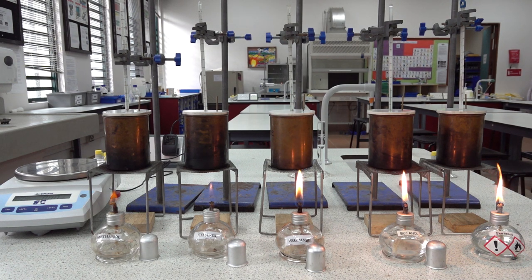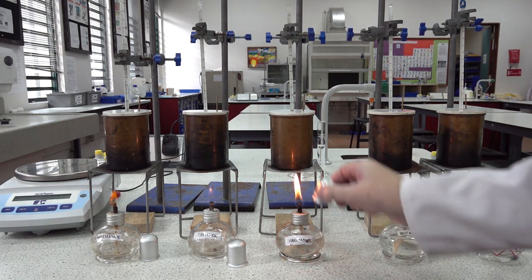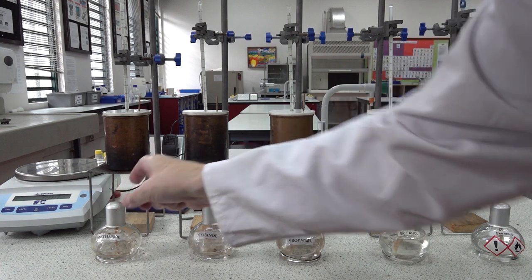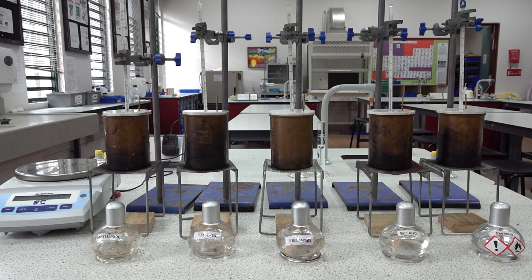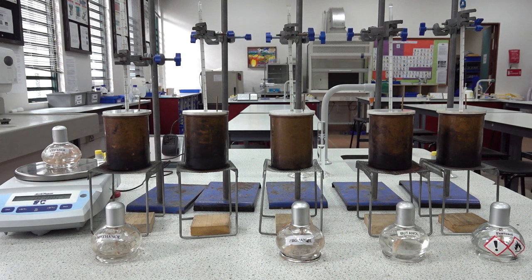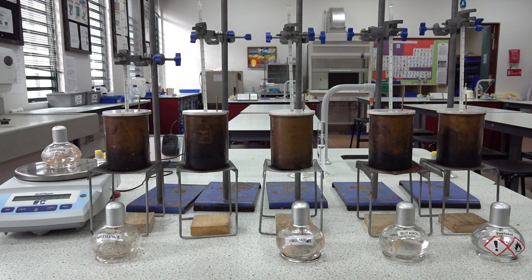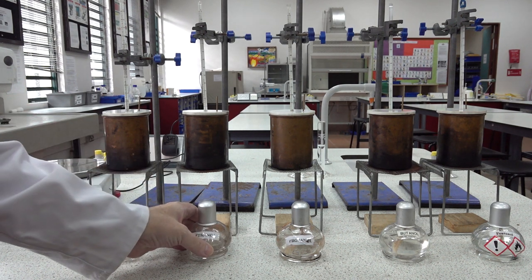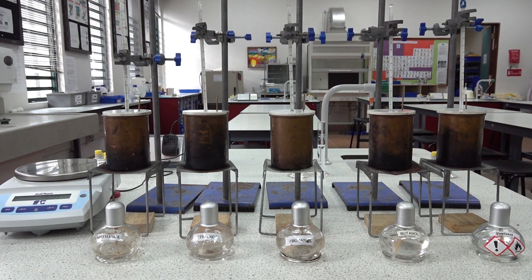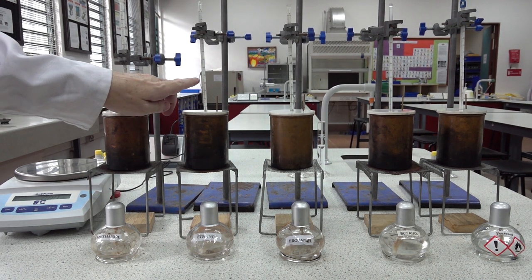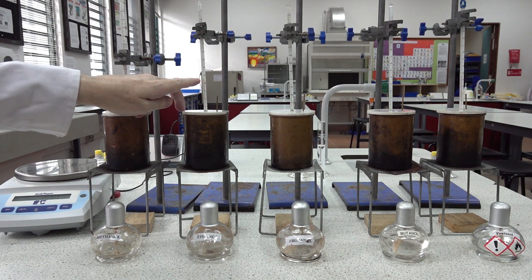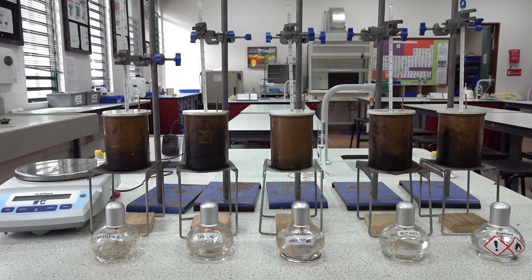First we need to extinguish the flames. Let's start with the ethanol. The mass of the ethanol burner at the start is 193.83 grams. We now need to take the temperature at the start for the water, and that is reading 26 degrees centigrade.